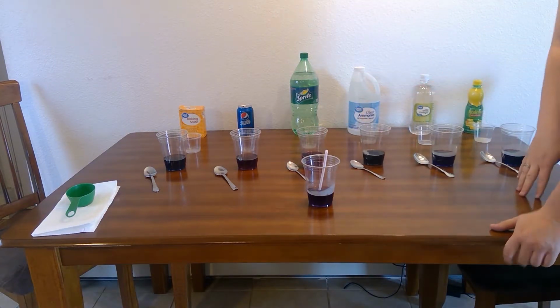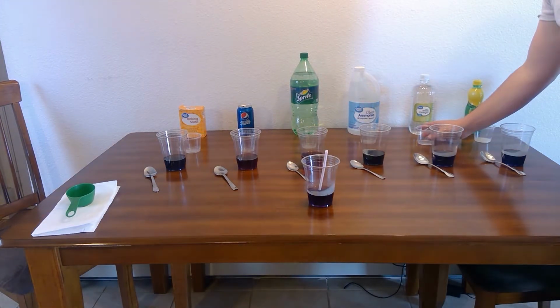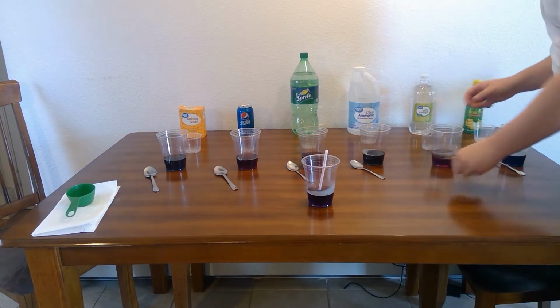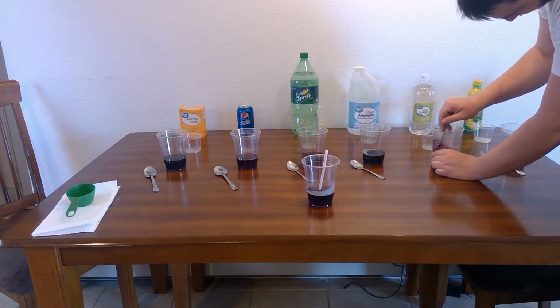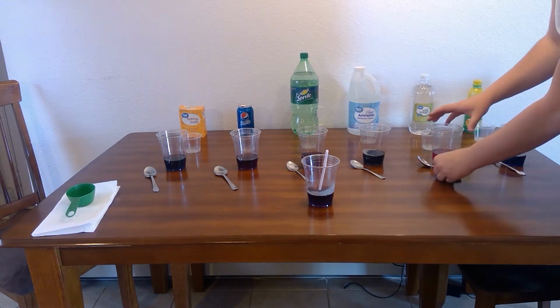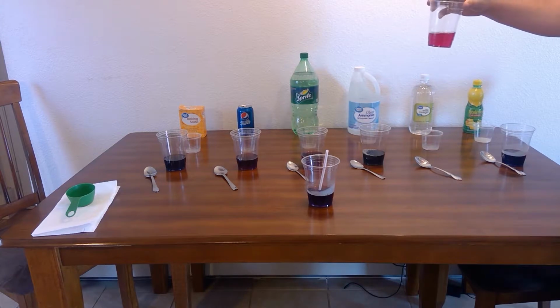So I would say that that's less acidic than the baking soda, if I have that right. And next is the white vinegar. Alright, that one is super pink, so that's very acidic.